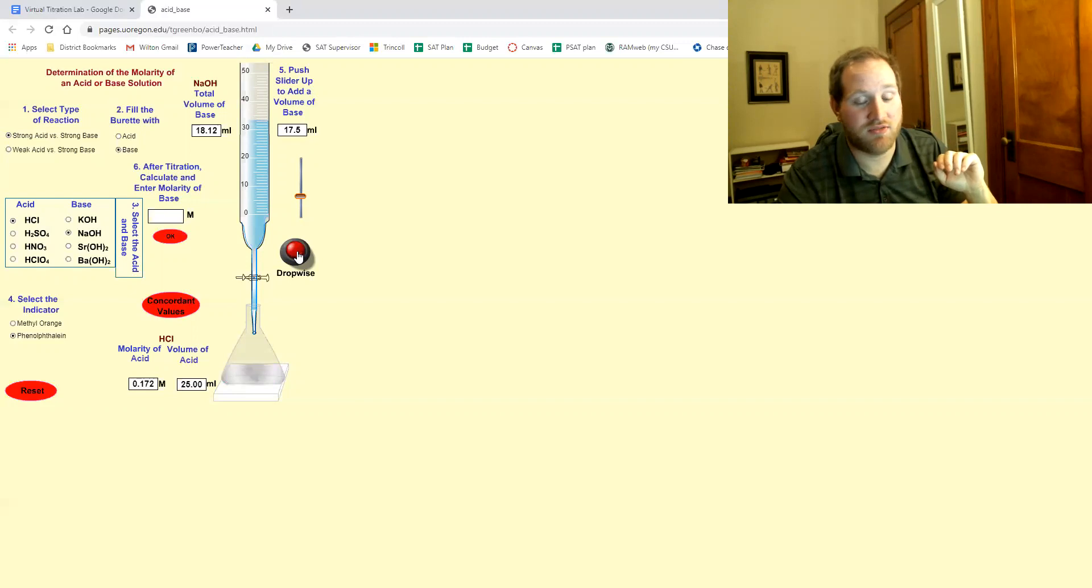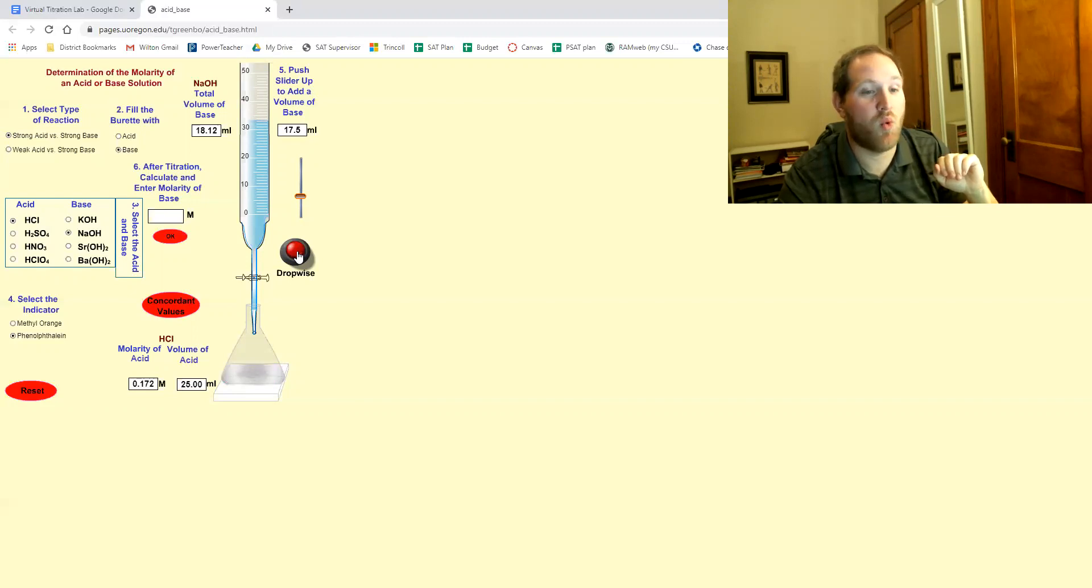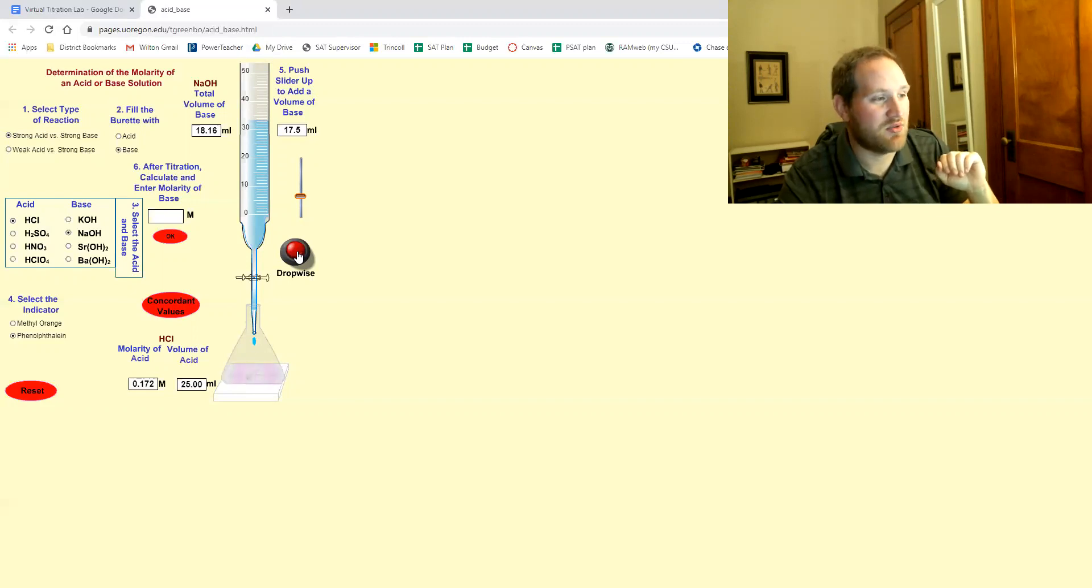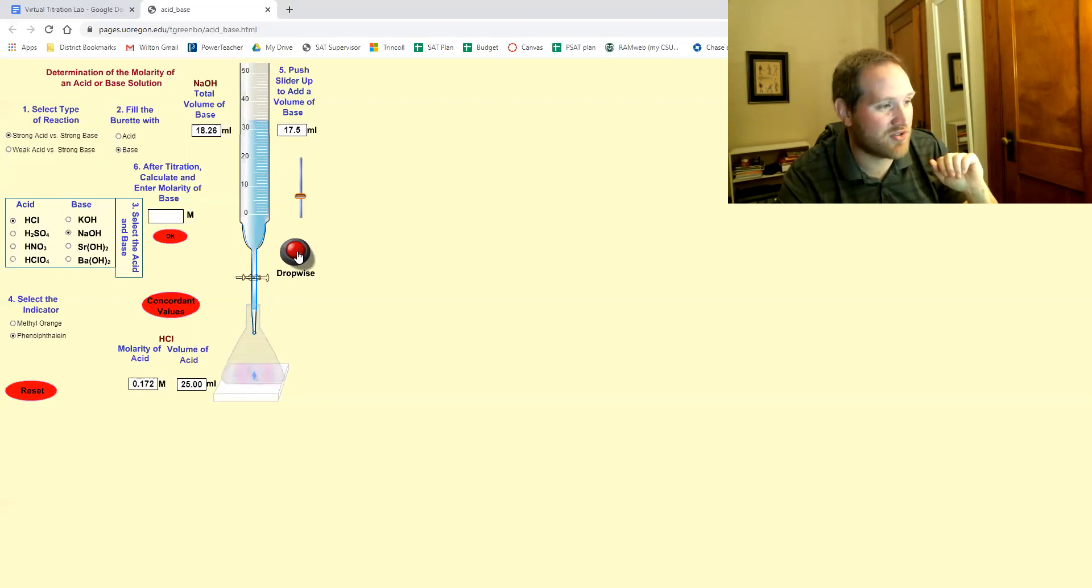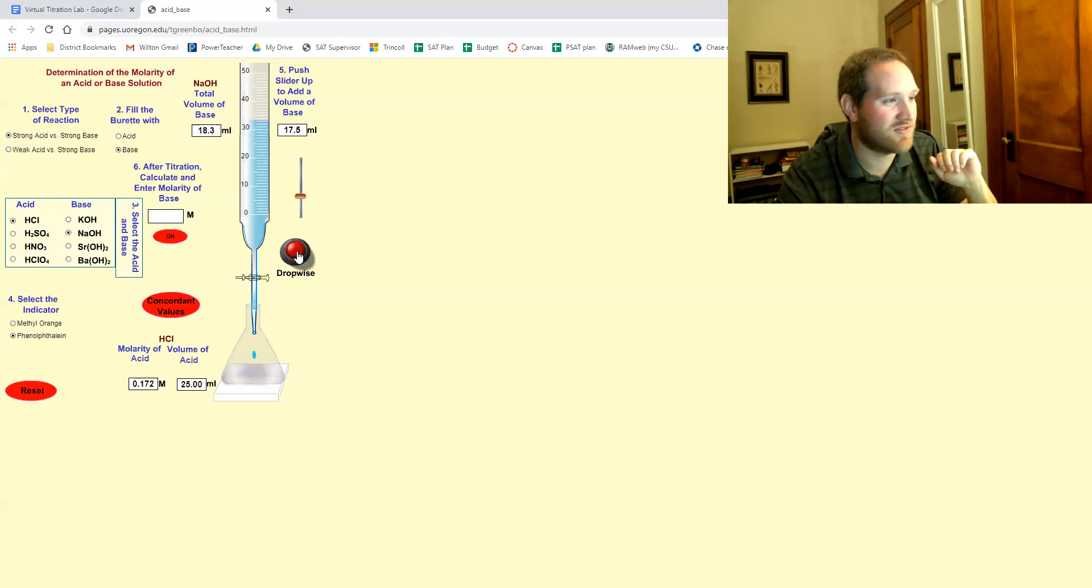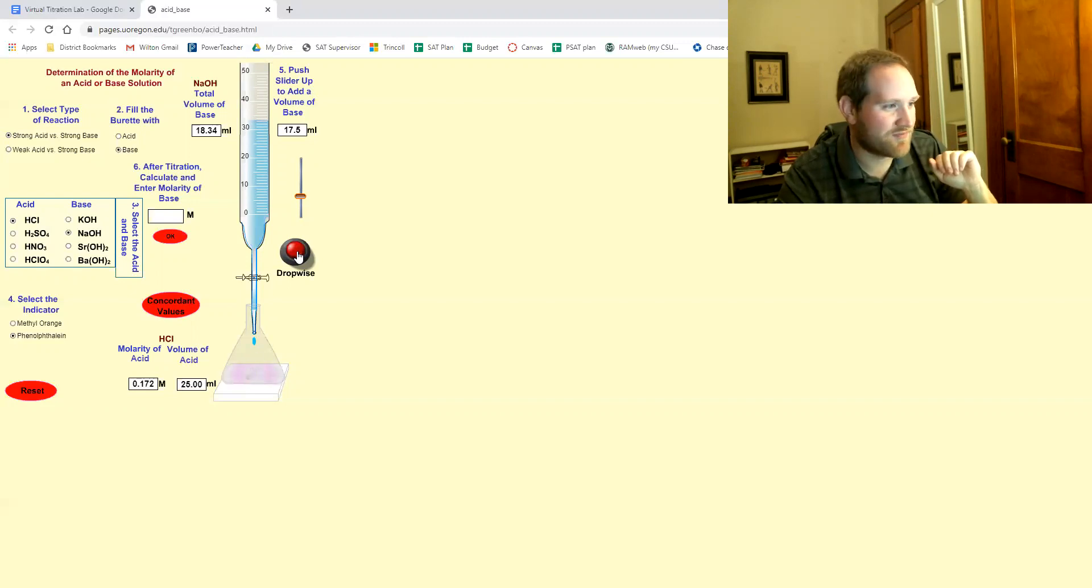In real life, you usually have one drop and we see people overshoot it all the time and have to restart the lab. And if you have to actually restart the lab in person, it's usually about 10 minutes of cleaning and measuring.